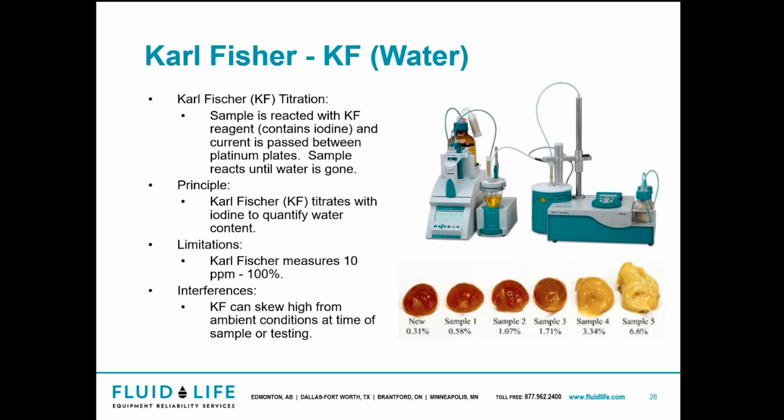And where we see a lot of bearing failure starting to occur is at about 150 parts per million. At 100 parts per million, your bearing life is almost half with that much water. Now, again, if we're doing the standard test where you're only waiting for it to start to change color, you're already significantly contaminated with water.